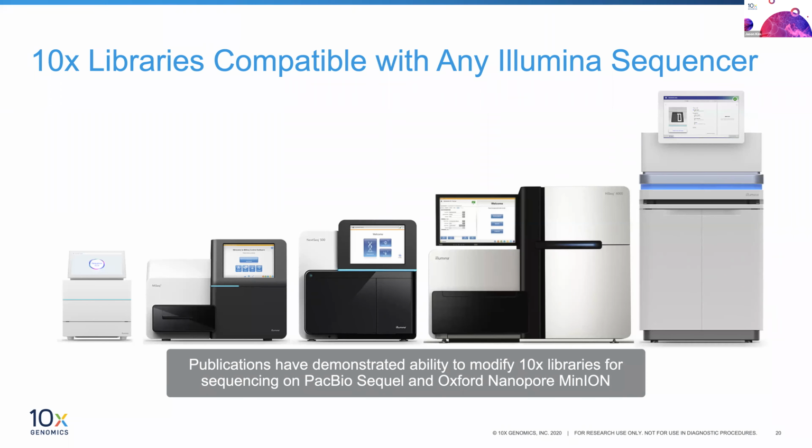So very, very cool things are happening on the informatics side that involve both the single cell and the spatial worlds together. And some examples of this, and I'm not really going to go into these next couple of vignettes in exhaustive detail, but really just to show the different ways that this trend is manifesting itself. I would say that right now it's almost hard to find papers that are purely spatial in nature. There are a lot of folks trying to combine the two.